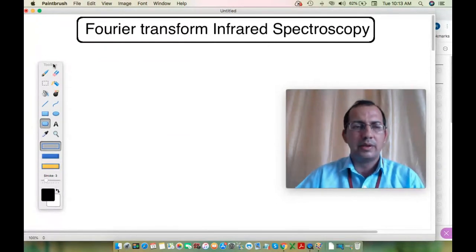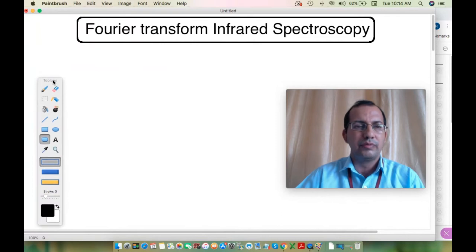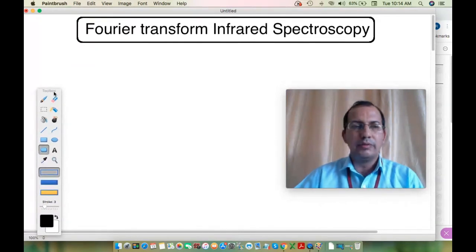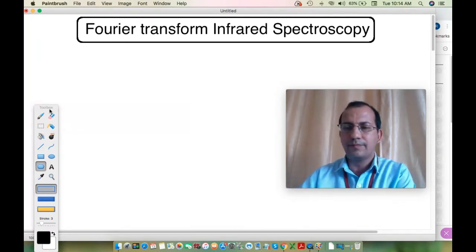If you are having nuclear and particle physics, still they use FTIR spectra in many cases. If you are an electronic student, then also you use it. And materials science students, of course, they are always involved in the FTIR spectroscopy. Even across disciplines like chemistry or other departments, the bio departments, they use this FTIR spectrometer. So let's see how we would like to come to this point today.